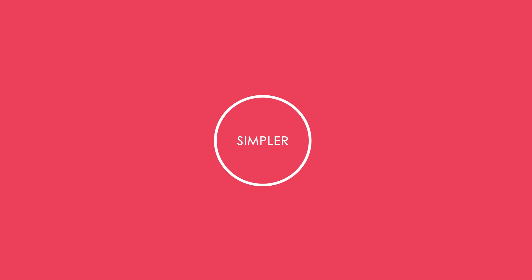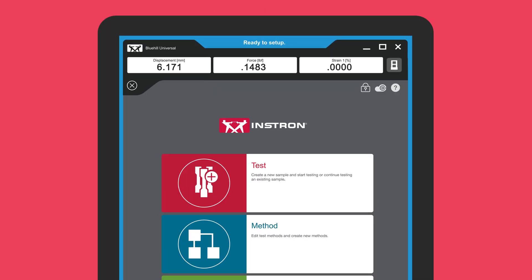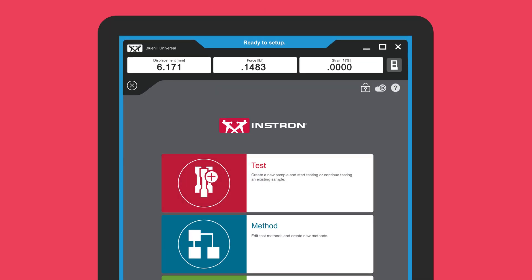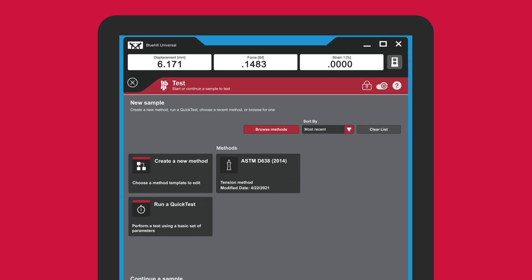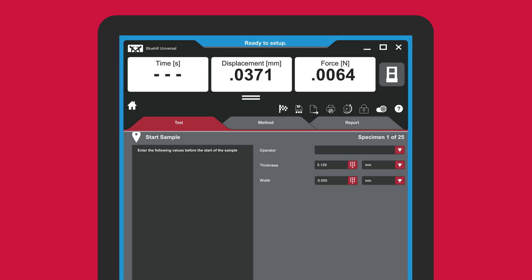Starting a test is simple. Users can create their own method or select from a list of pre-configured methods written to the most common ASTM and ISO standards.